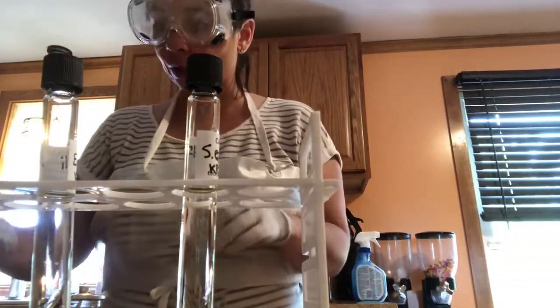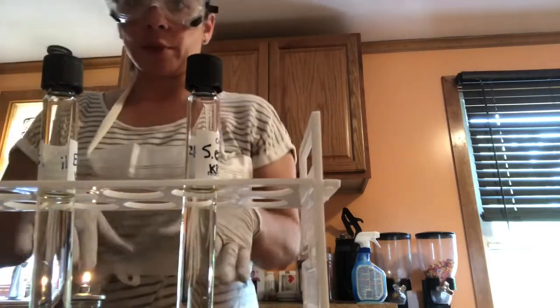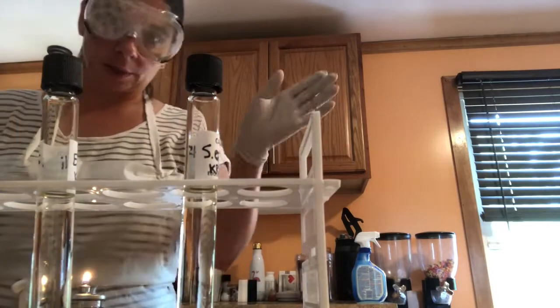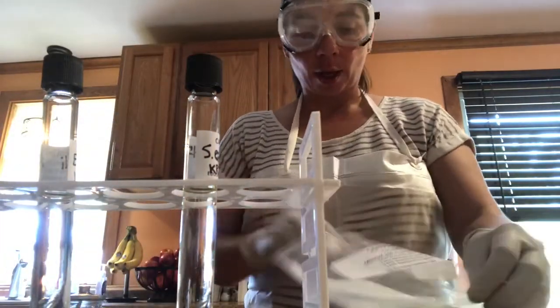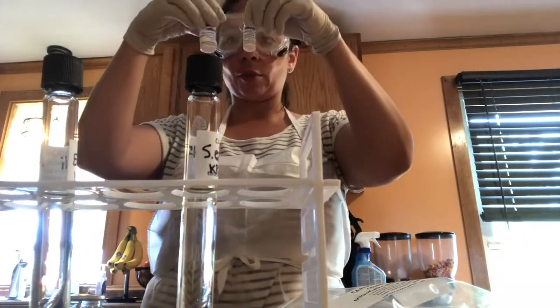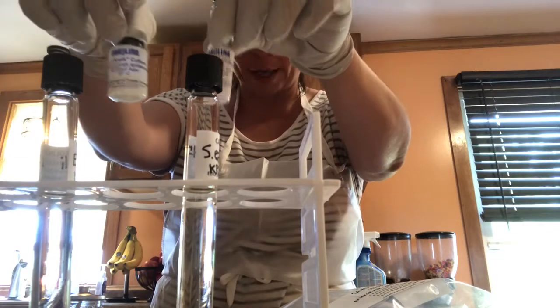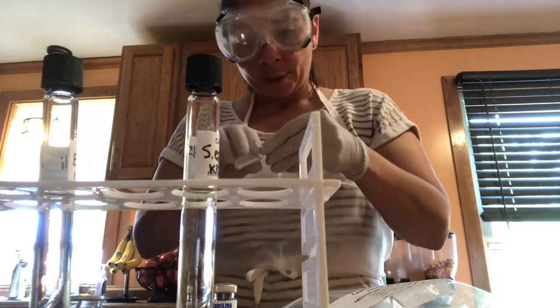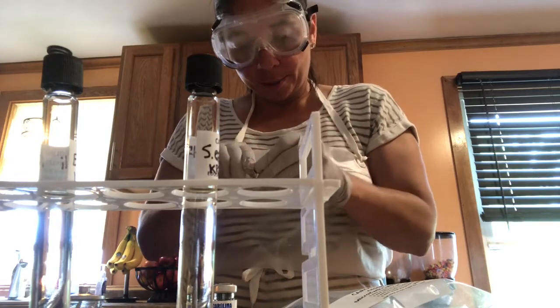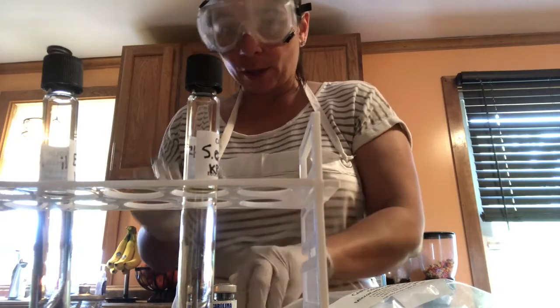Okay, and then I'm going to come over here. Now, before you do this, you want to make sure that you have 2 sterile transfer pipettes out. You want to make sure that your flame is going for as long as it stays on. And then you want to grab your 2 lyophilized, freeze-dried cultures. The staph epidermidis vial is a little bit bigger, wider than the E. coli. For me, the trickiest part is just getting that metal piece off the top. And remember to be careful and not break any fingernails off or anything.